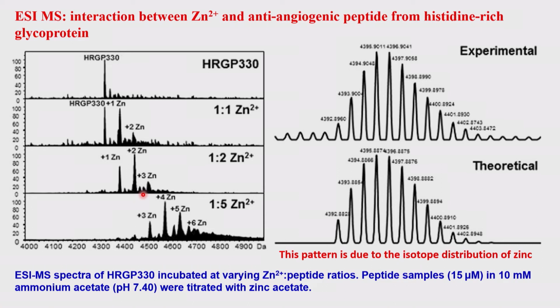without any ambiguity. Now you add 5 equivalents and your free protein is not seen. With 1, with 2 very little, with 3 metal ion bound protein, 4 metal ion bound protein, 5 metal ion bound protein, 6 metal ion bound protein. So you have a distribution of the species. So all these can be seen, and how will you work out?